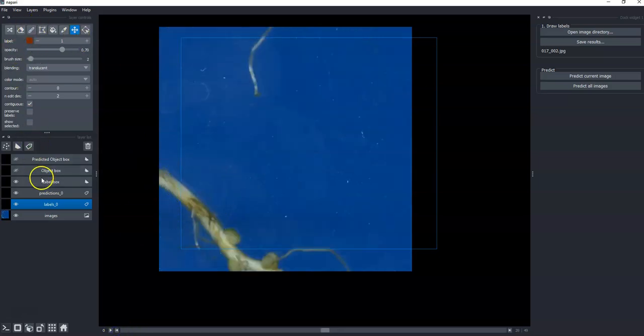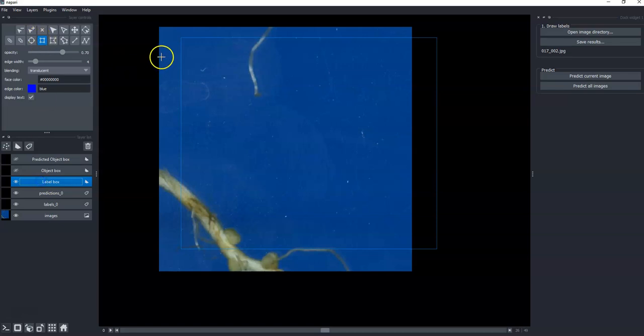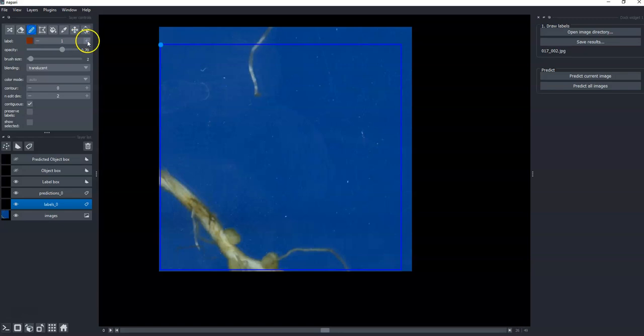Once again, I grab the label box and draw a region around this, and then I can use the painting tools to color these guys in, and I can make the brush really big for this one here. And yeah, Napari just makes this really easy. And the purpose here isn't to get the best labels ever, because I'm really just experimenting, doing a video showing how to do something, also testing some of my widgets.